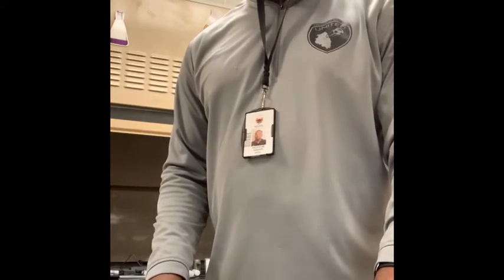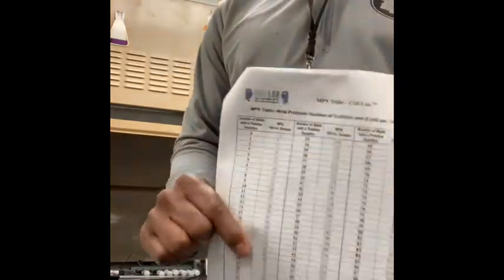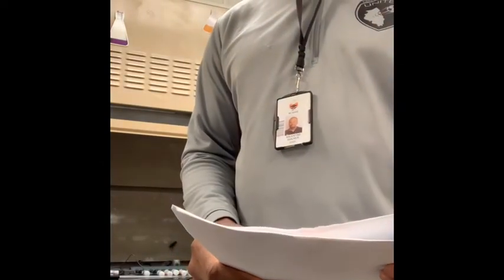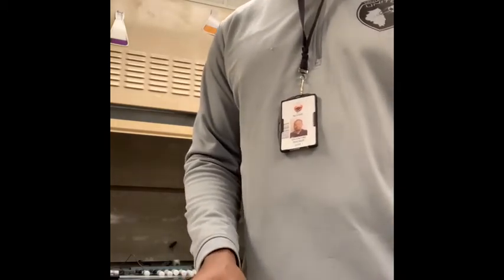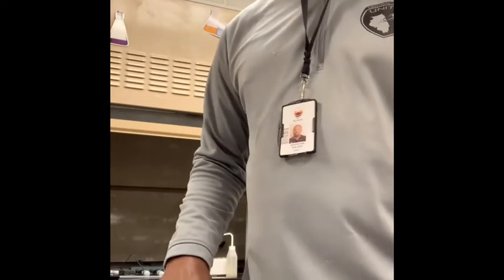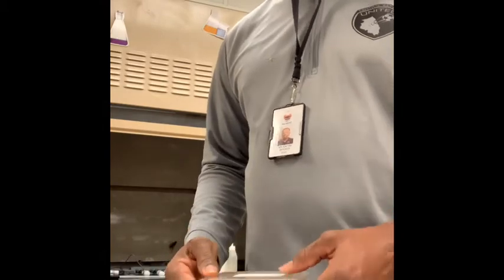And from that number, we use the most probable number of coliform bacteria table to determine that there are at least 19 colonies of coliform bacteria per 100 milliliters of water in our sample.